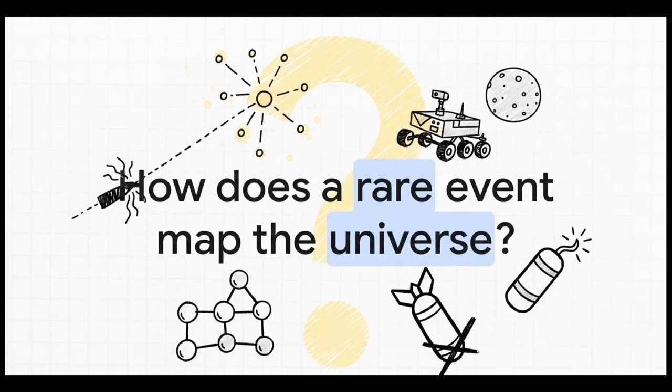And honestly, that brings us to the true superpower of Raman spectroscopy. By shining a laser and isolating a quantum event that only happens to 1 in 10 million photons, we can look at the Stokes shift and deduce the exact vibrational modes, the precise chemical bonds, and the unique identity of almost any substance. From checking the purity of pharmaceuticals, to detecting explosives, to literally analyzing the minerals on the surface of Mars with the Perseverance rover, this bizarre little quantum quirk is mapping our entire universe.